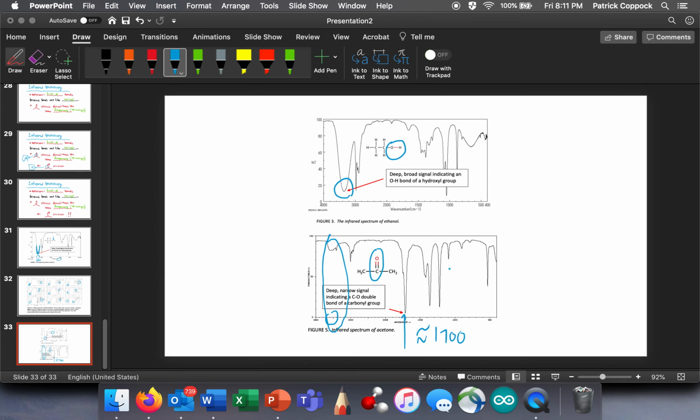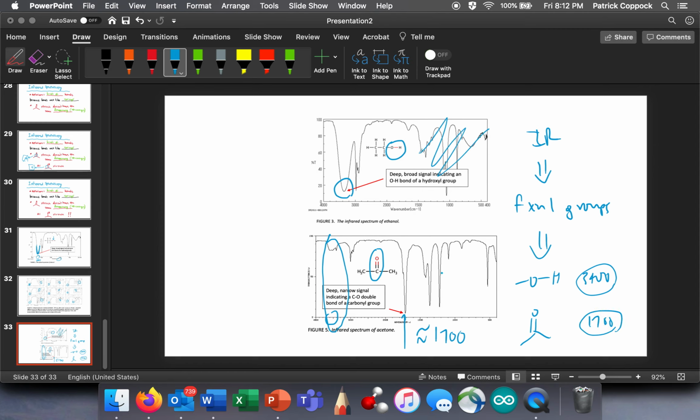and you'll see that that's also very reliable. Okay, so the one thing I'd like you to take from this video: infrared spectroscopy, IR, tells you functional groups, right? And be more specific now. In this case, OH, you get a telltale signal at 3,400, or you get a telltale signal at 1,700, okay? Now, there's a bunch of other things here that we don't care about, so that's a little unsettling to students, right?